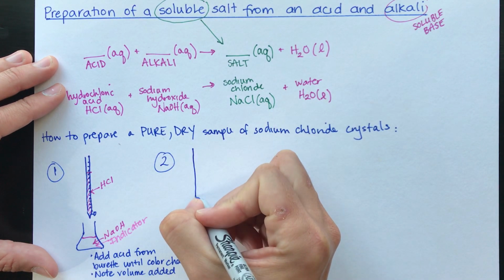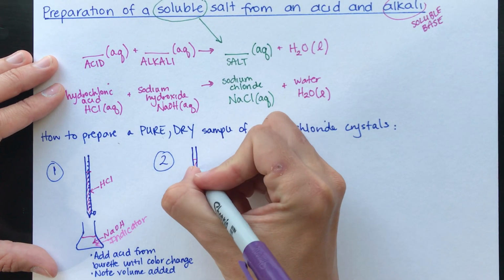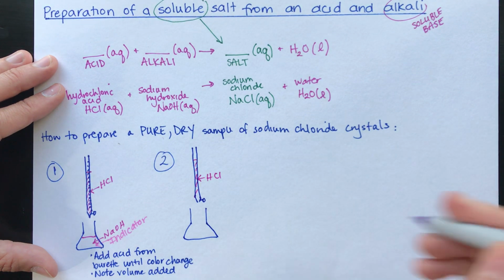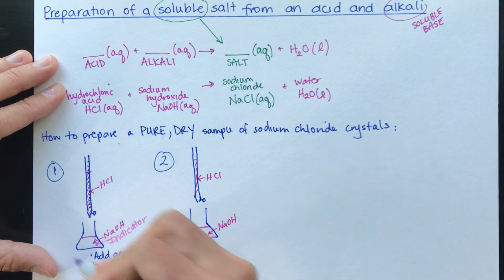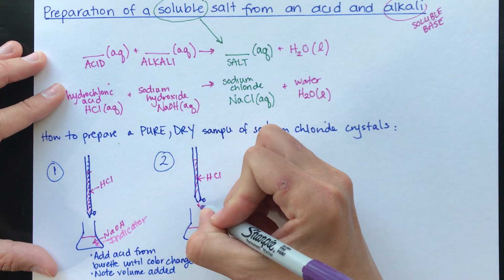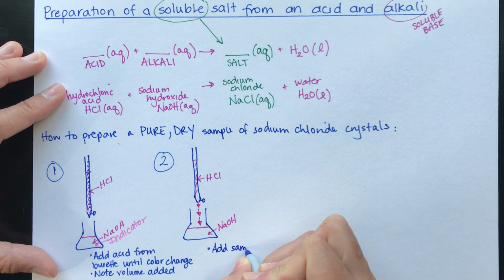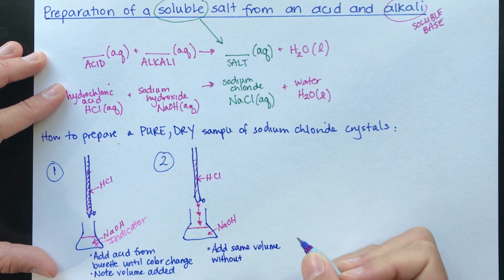You need to get your burette out again, put your HCl in your burette, rinse and dry your conical flask, put the exact same amount of NaOH into the conical flask, and repeat the whole process. Okay. This time, adding the same volume without indicator, to make sure your final solution is pure.